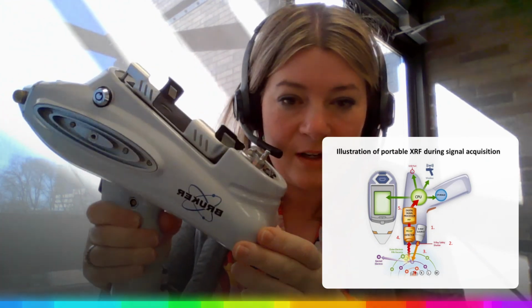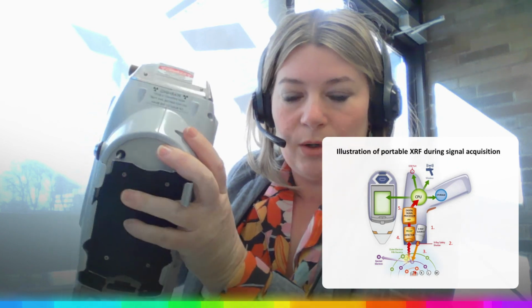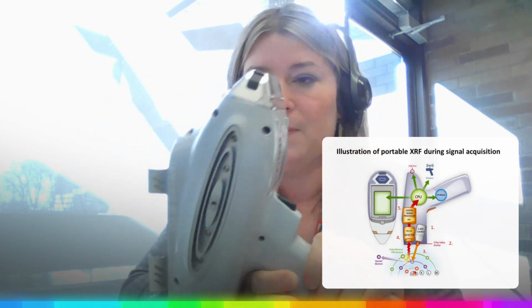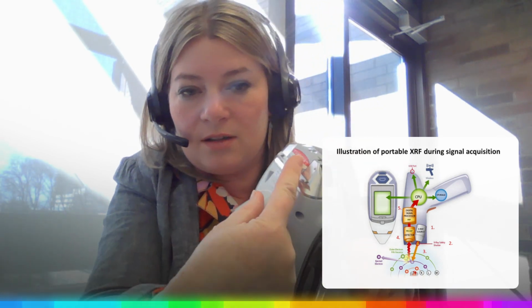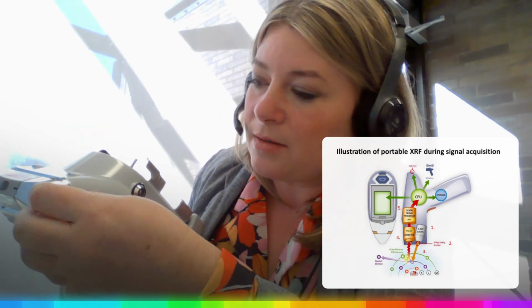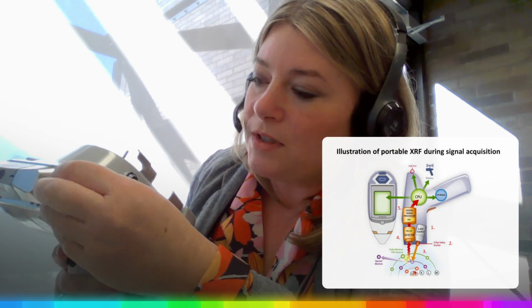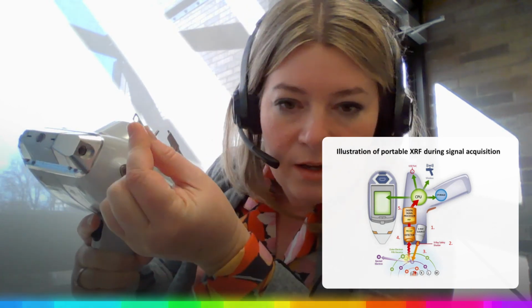I'll show you an actual portable X-ray instrument. Here it is. So the source is located here, and the detector is located here. Let me hold it exactly like the picture is showing. Okay. Here's the source back here, and the detector back here. And this brass ring on the side, this brass nut, can be removed and a filter placed into the instrument through that port.